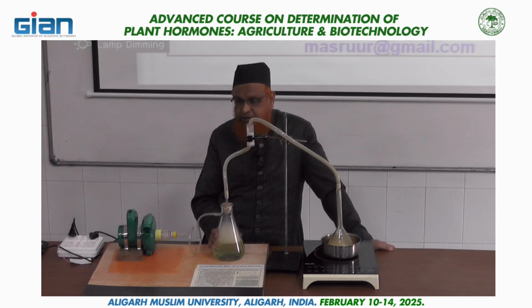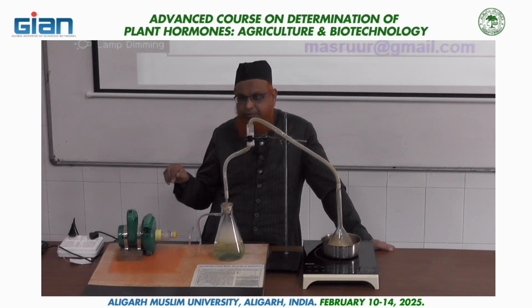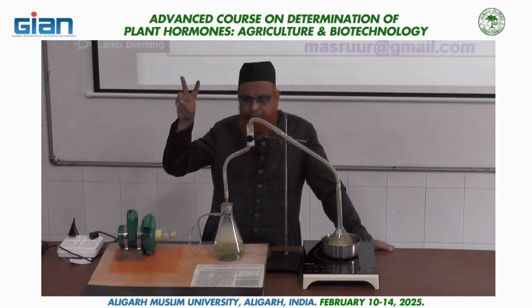Now this water is ready for giving the treatment to the plant, right? So you have to dilute it first. Take 1 ml of this and 999 ml DDW. This will be a dilution of 1:1000, right? Then you have to take the second treatment. Take 1 ml of this and take 499 ml of distilled water. Dissolve it. This will be treatment 2.